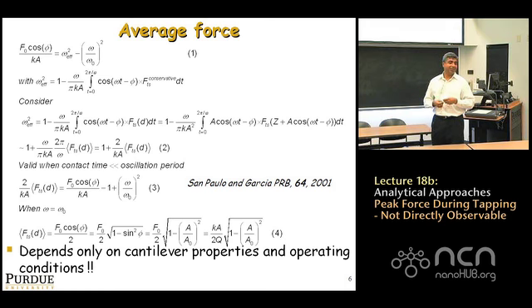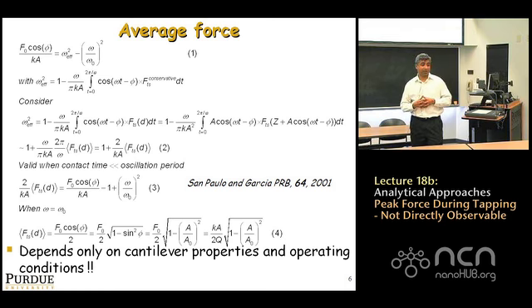the phase. What you don't know is, are you applying 10 nanonewtons? Are you applying 20 nanonewtons? By the way, when I say 10 nanonewtons in AFM is already a large force, do you know why I say that? 10 nanonewtons is a large force already? The pressure is extremely large. So 10 nanonewtons applied over a contact area of 1 nanometer squared.